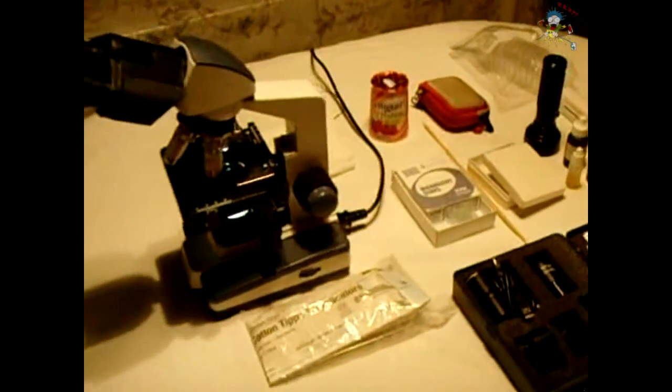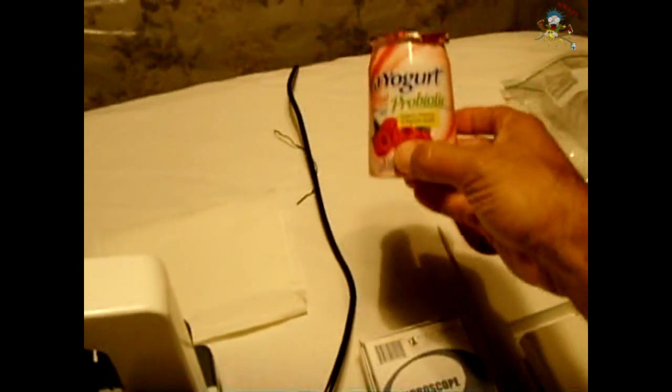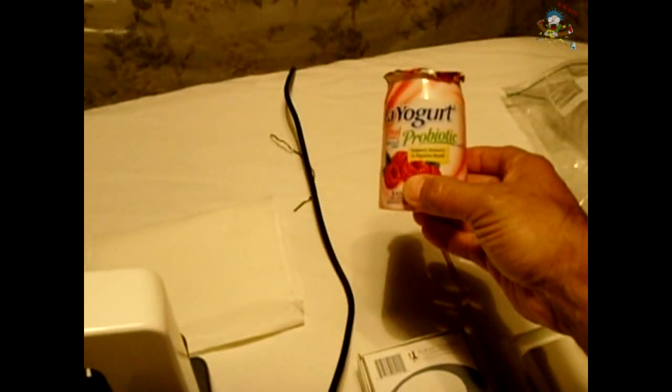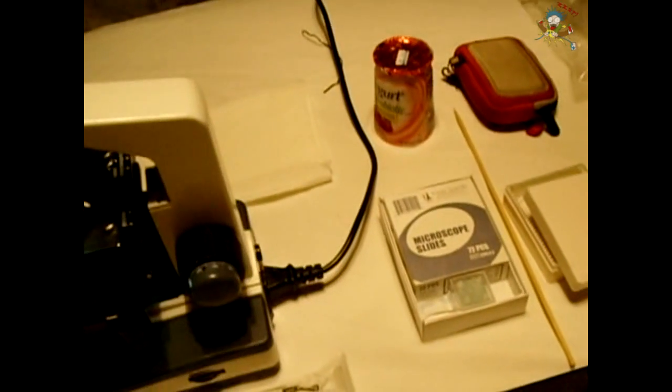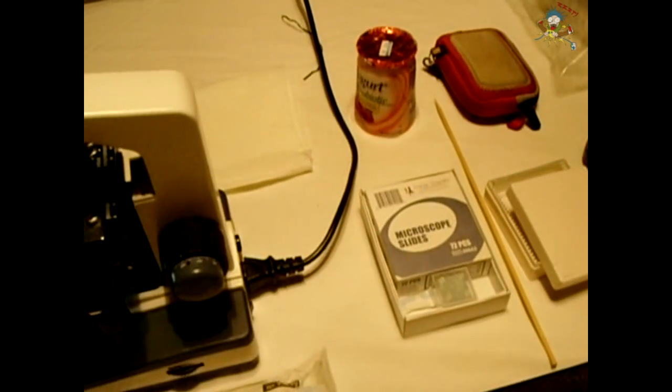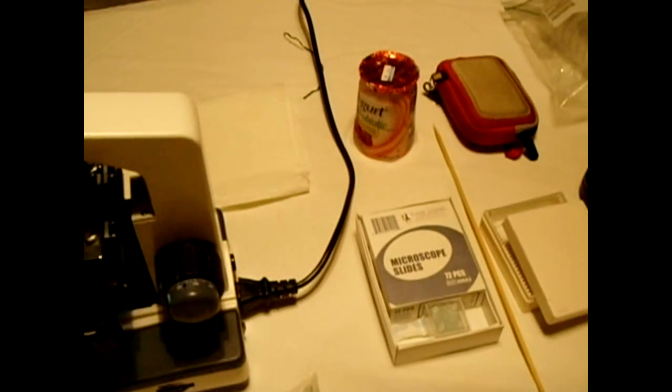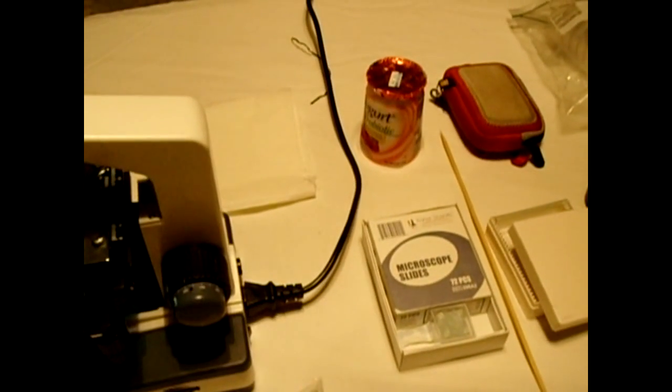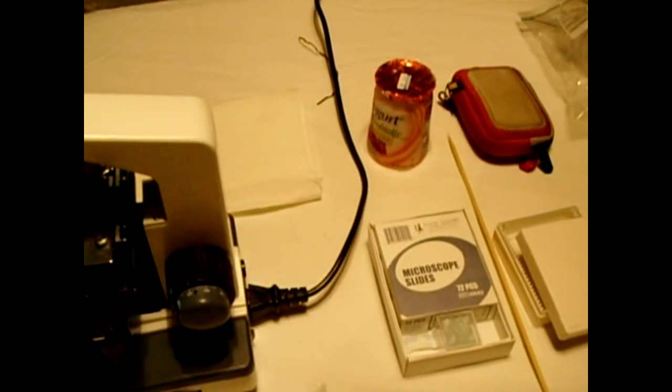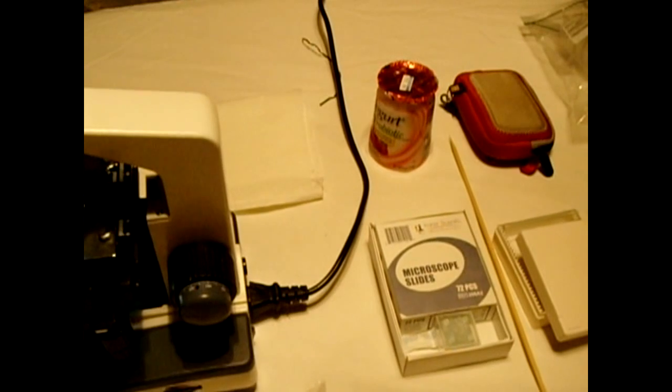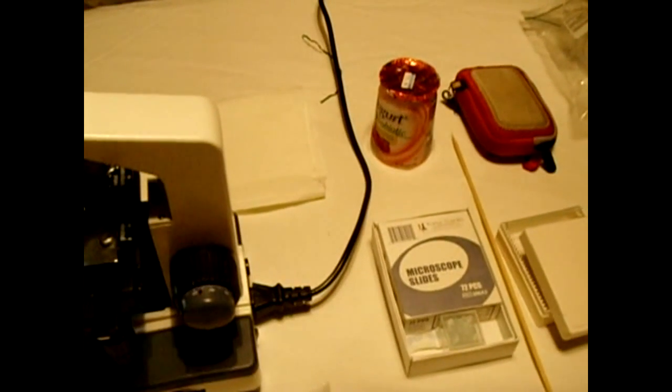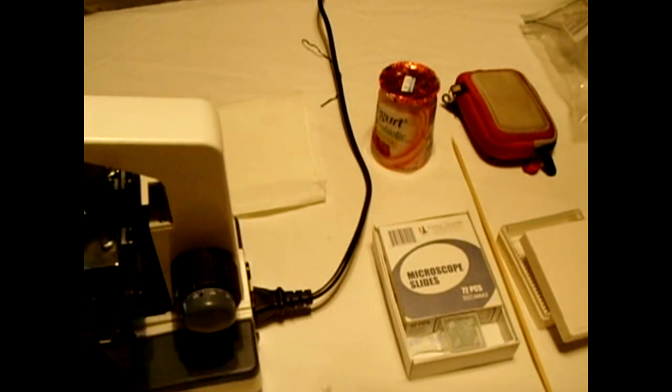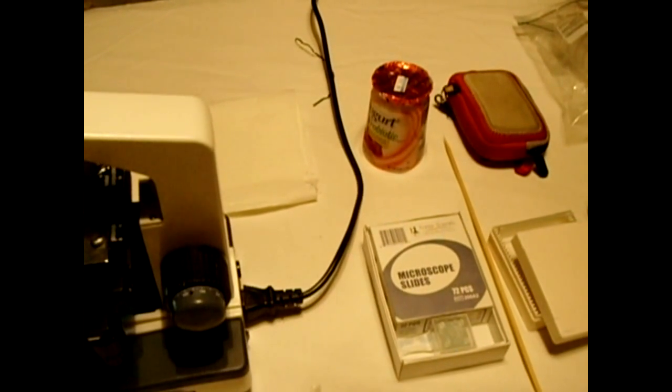In this case it will be this brand right here, probiotic yogurt. We're going to be taking a look at the active bacteria cultures that are in that yogurt. I'll be placing them on a slide, and once that bacteria is placed on that slide we will observe what it looks like under the microscope. Now one other thing that I would like to do after we view the live bacteria under the microscope and also identify a few of the bacteria that are inside that yogurt, we can pick them out under the microscope.